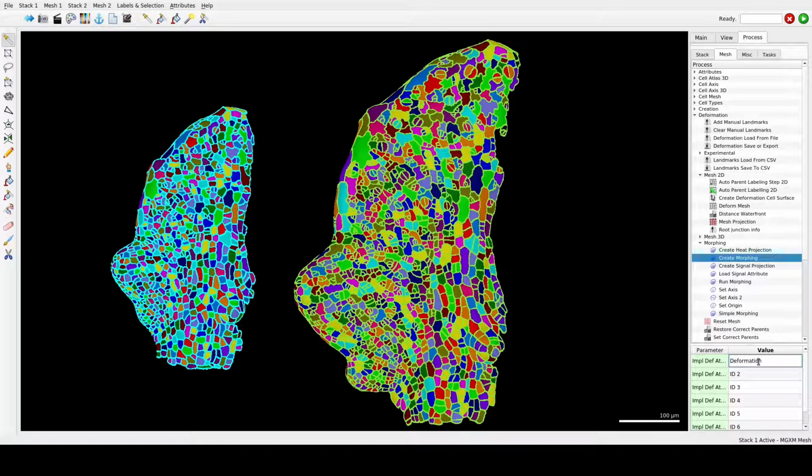It's called deformation. Of course you can create a growing animation using different time points by saving the deformation functions as different IDs. You can try it later if you have some time: load the parent labels corresponding to T1 to T2, then save the deformation, T2, T3, save deformation, and so on. Then you can put all the different attributes here, and you will see deformation for all of them.